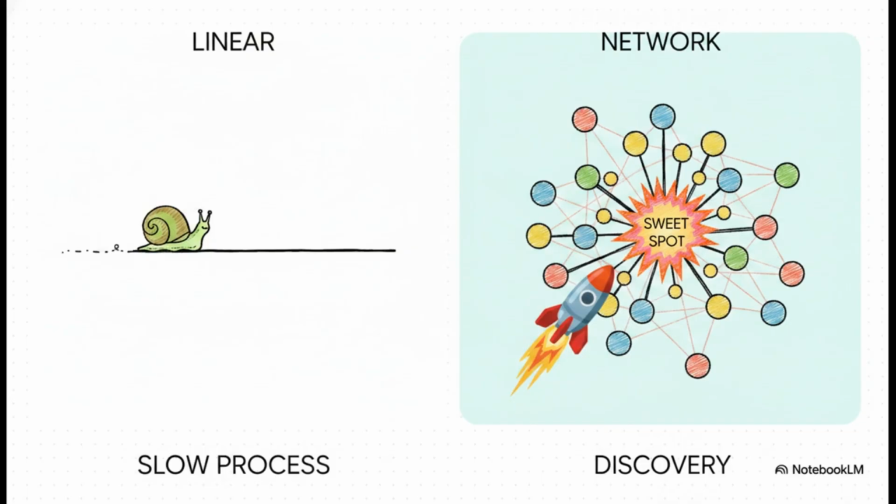And this is exactly why you need to abandon the old one factor at a time method, or OFAT. Just drop it. It's slow, it's highly misleading, and it completely ignores how variables interact with one another in the real world. A higher sample dilution might only solve your problem if you simultaneously increase your detector concentration. DOE evaluates multiple factors simultaneously, revealing those hidden golden combinations that actually control your sensitivity. Look, DOE isn't just some dry statistics exercise. It's a sanity-saving strategy that prevents massive downstream disasters.